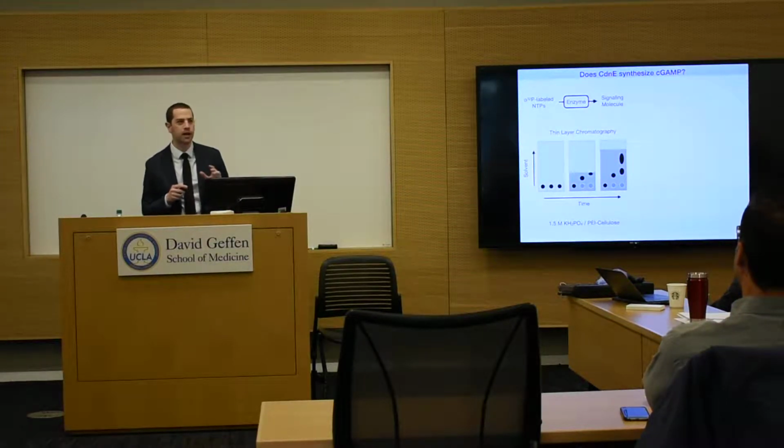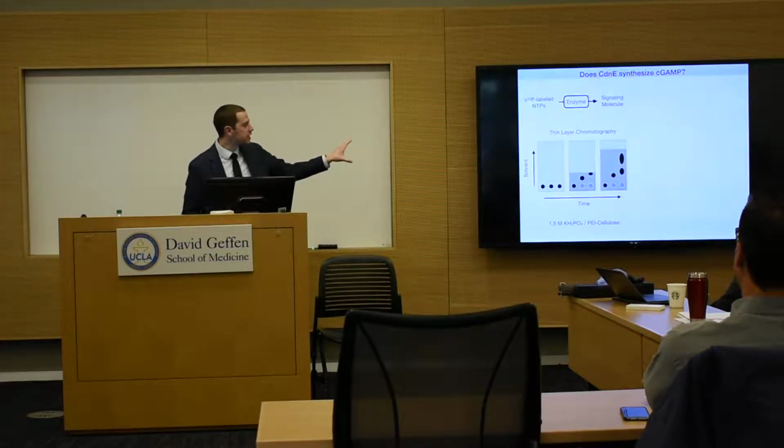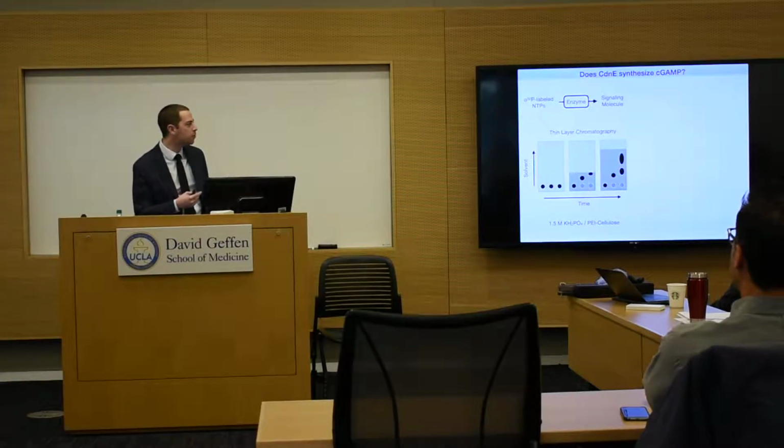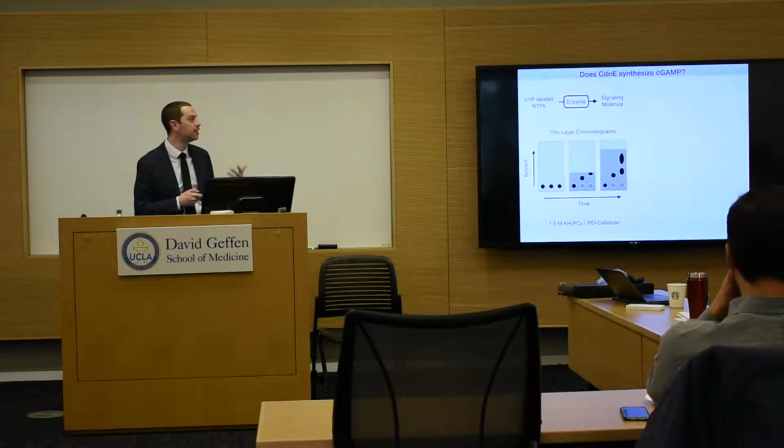And so to remind everyone how that works, we're spotting our different complex reactions along the x-axis of a TLC plate at the bottom. And when we immerse that TLC plate in solvent, now the interaction of our signaling molecules with the mobile phase tells us something about the identity of that molecule and gives us a unique migration pattern so that we can quickly read out what CDNE is synthesizing.